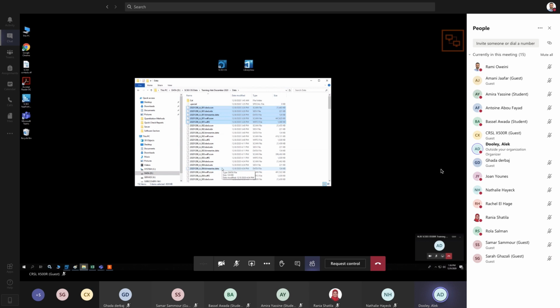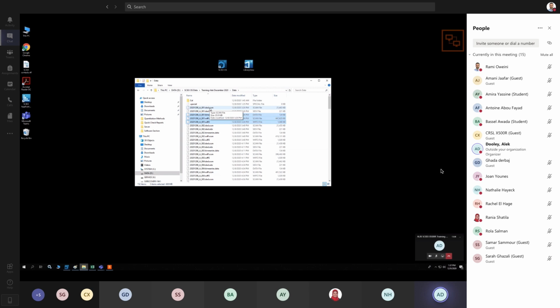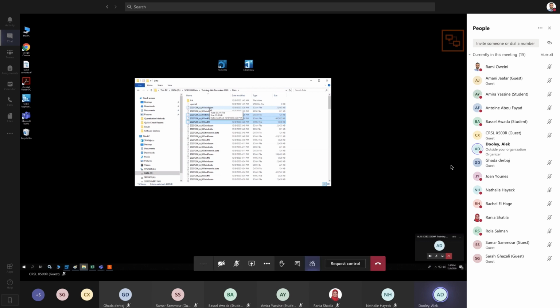So for sure you have to take these 3 data files when you go to your third-party software. And if you have the DAD data, then you want to take those 2 as well. So you need all 5 files for each data file. And you can just copy those. I don't know what your rules are about IT and so on. You can put a USB stick into the computer if that's allowed. Of course, just be careful with viruses and all that stuff, or you can do a transfer over the network, whatever you want, and those are the data files.